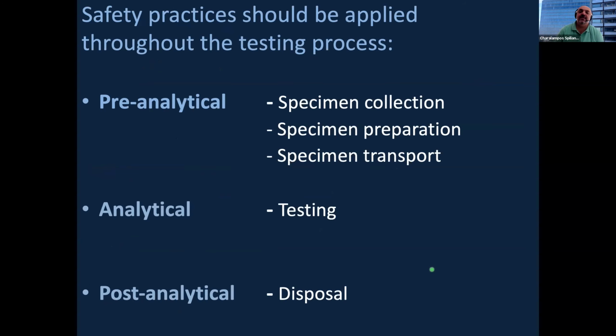We need the safety practices before performing an experiment. For example, when we collect or prepare a sample for transport, imagine if we are talking about, let's say, blood samples that have to be prepared and transported from the hospital to a research laboratory in order for certain exams or experiments to be performed. So the safety practices could be applied before the experiment, during the experiment, but also after the experiment, where we have to dispose of all the contaminated material.